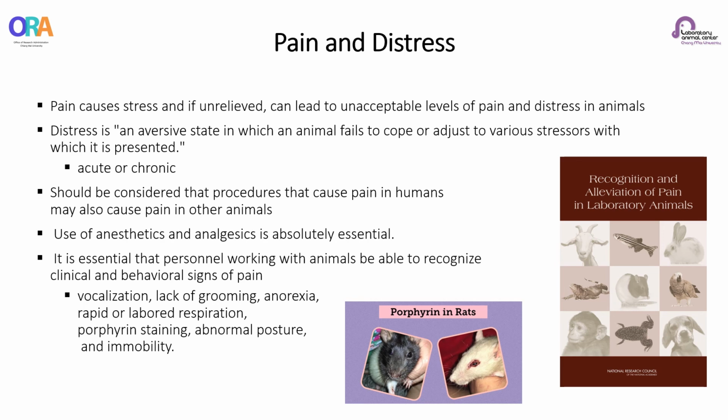Therefore, it is essential that personnel working with animals are able to recognize clinical and behavioral signs of pain in the species that they are working with.